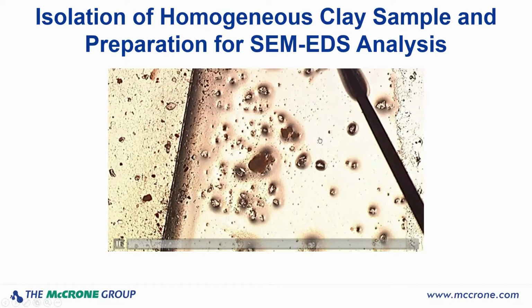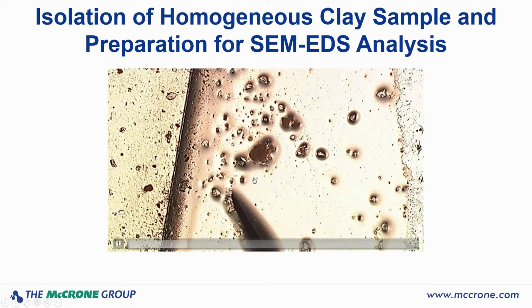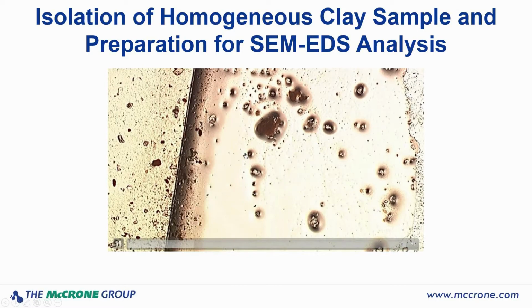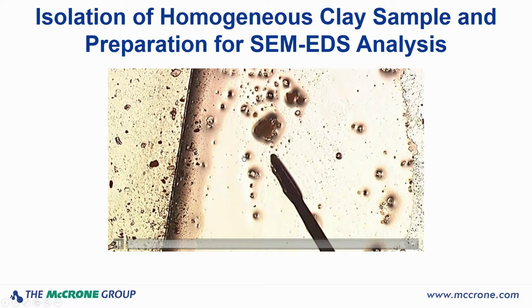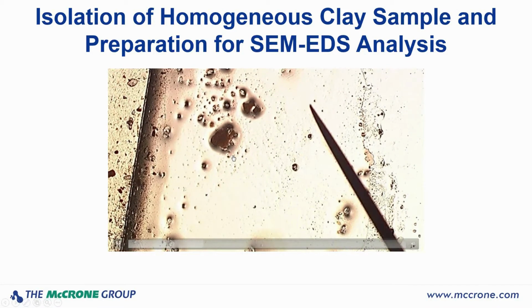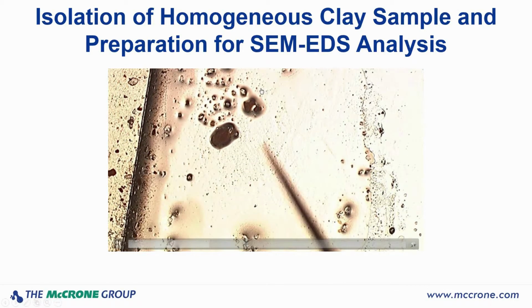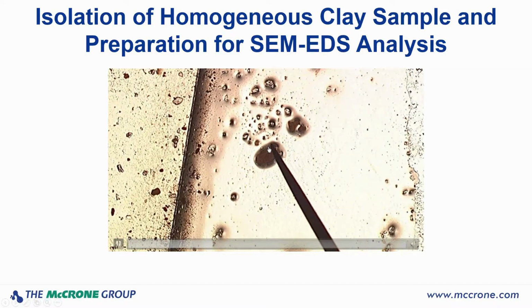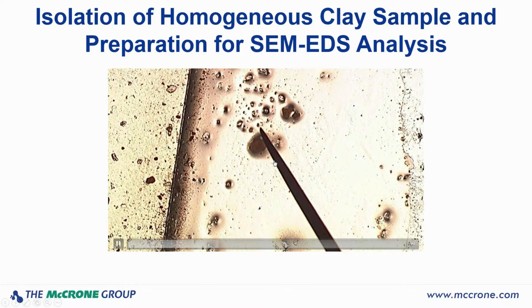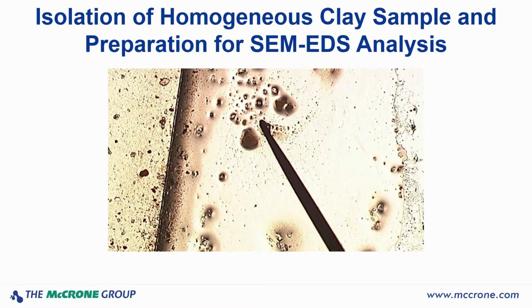Now I'm going to use my tungsten needle. You can see the liquid on there at the end. All I'm doing at this point is just grossly removing refractive index liquid and some of this extraneous particulate that I don't want to worry about. I just want to slide as much of the gross material away as I can. Now you can see I've identified that I've got a couple of those colorless particles actually on the edges here. So what I'm doing now is I'm using my tungsten needle to pull those potassium nitrate particles out and move them away. There we've got rid of them.